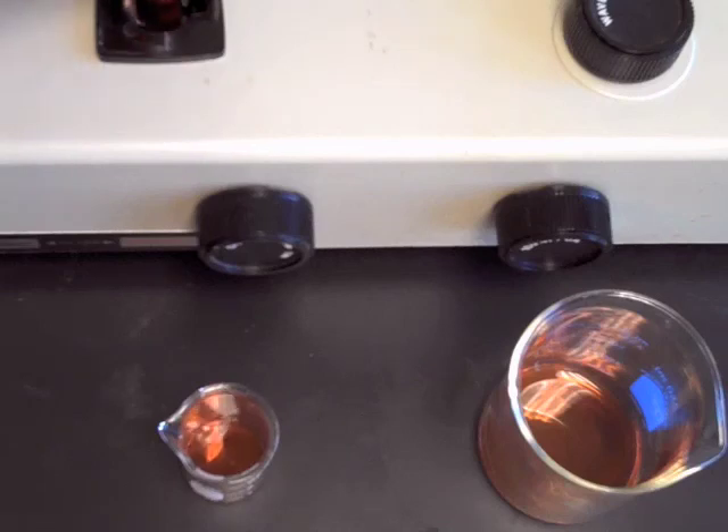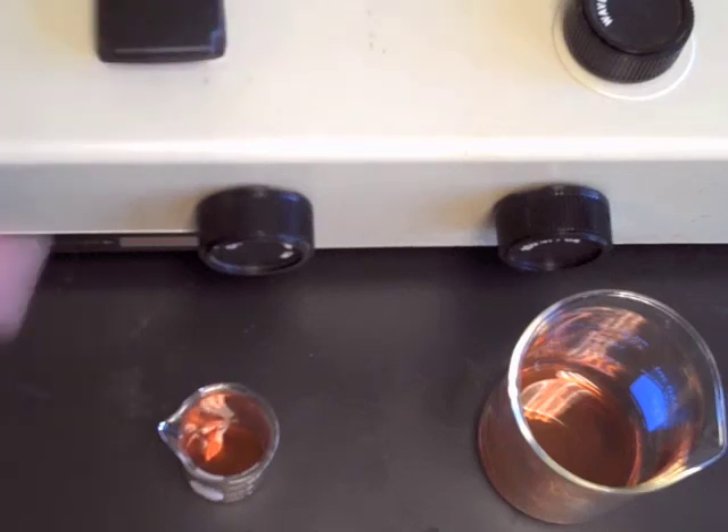At the end of the day, merely rinse the cuvettes with soapy water and deionized water and leave them drying in the rack. Do not scrub them out.